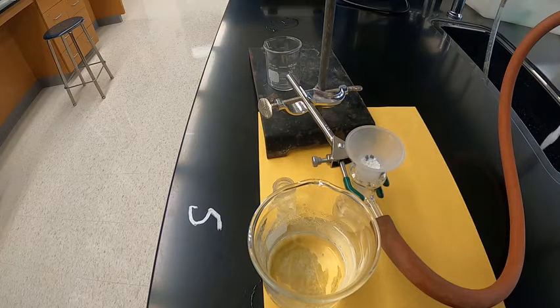So for the procedure, you can greatly summarize what's written there, just to at least highlight which major steps were done, and in the report you can talk about the reactants and the products and the materials and how they were set up and used, and again greatly abbreviate what I provided for you. So it's not meant to be a word-for-word verbatim modification of what's there, but just an abbreviation.